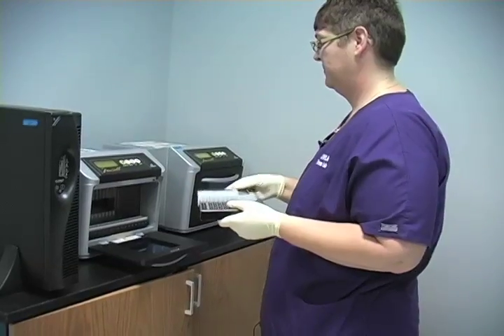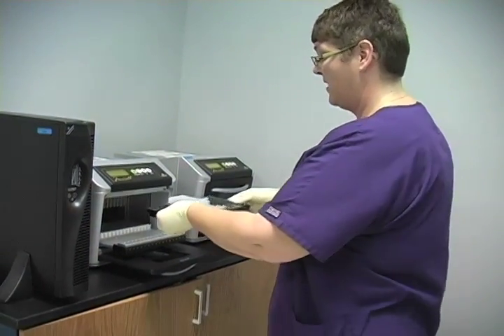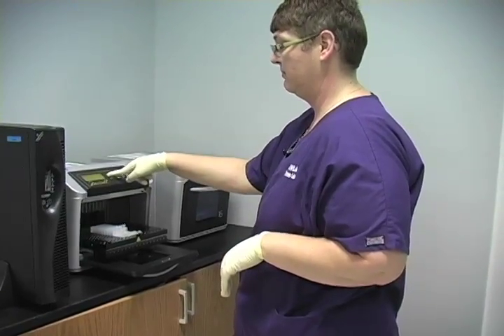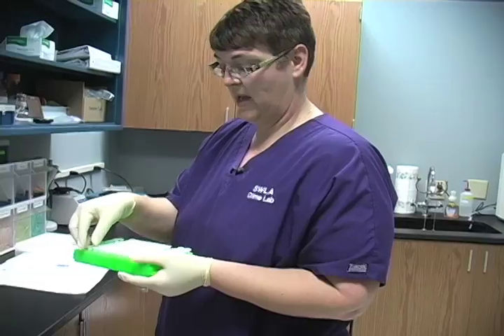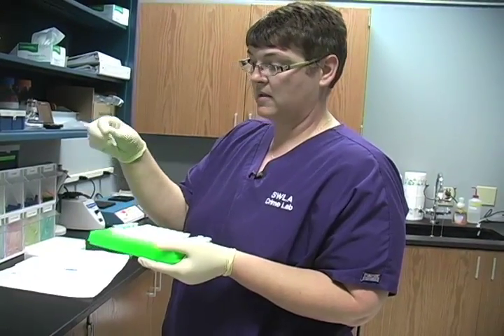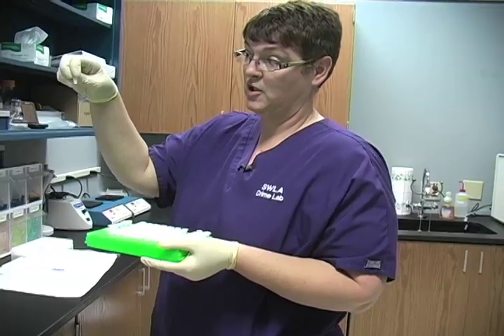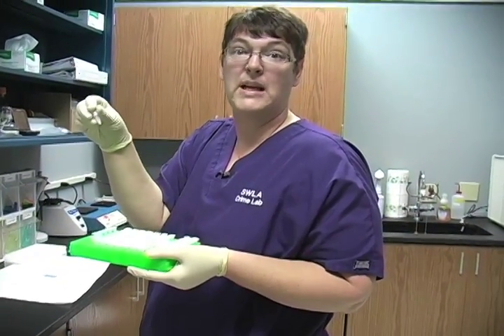We need to get the biological material off of that substrate, as well as break those cells that are in the material open, releasing just the DNA. We end up with just a final product of DNA sample in solution, and it's just a very minute product, approximately 50 microliters of sample.